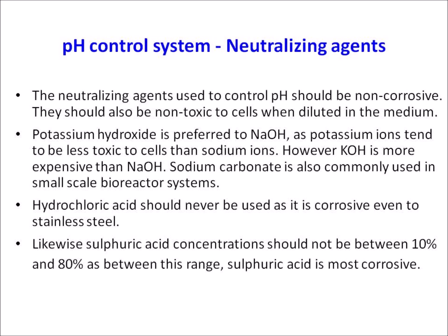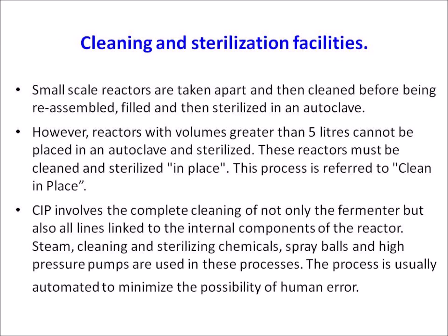Hydrochloric acid should never be used as it is corrosive even to stainless steel. Likewise, sulfuric acid at concentrations between 10% and 80% should not be used, as within this range sulfuric acid is most corrosive. The next is cleaning and sterilization facilities.